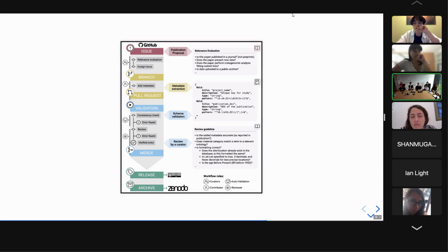That is possible. People can write that down. I think the value itself is more the issue. Is it like nanograms per microliter? Is it copies per microliter? There's a bunch of others with people reporting. That should all be consistent between the machines, I would hope.